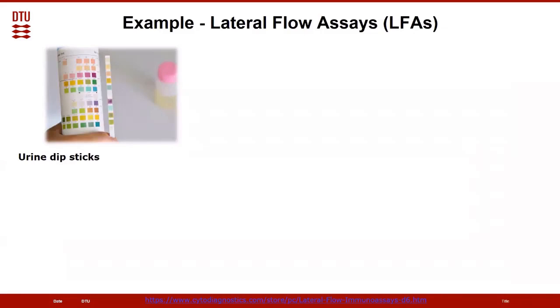So the essential part of a lateral flow assay is the paper. The paper is a strip of paper where you put these fluorescent dyes on the surface. And that paper is then dipped into the liquid where the analyte of interest is. And then the paper will change color if that analyte is on the surface. And that paper was in the 80s integrated into a stick for only HCG. So when you peed on the stick, you would get these two lines whether you're pregnant or not.